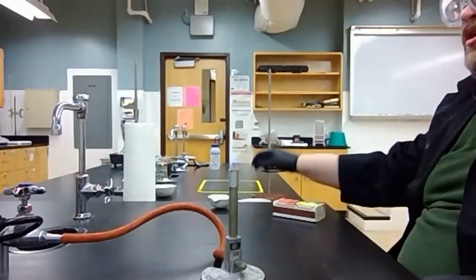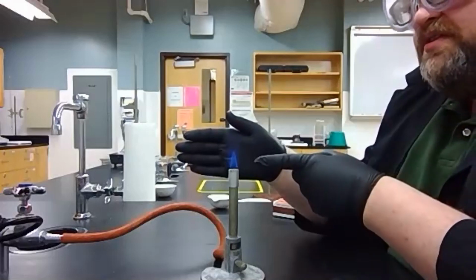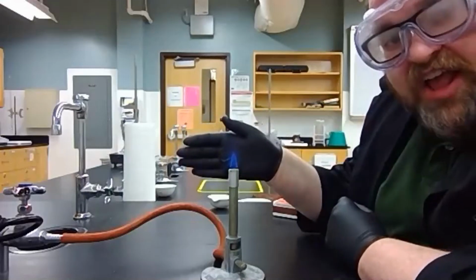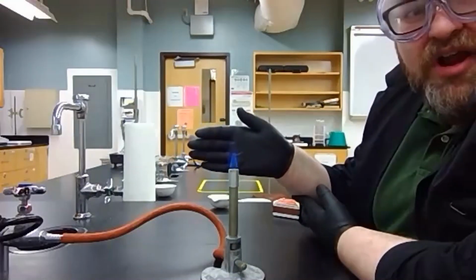Look at that beautiful, stable 2 blue cones of flame. There you go. You can see the inner blue cone and the outer blue cone. The inner blue cone is most definitely the hottest part of this fire. It's the hottest part of any fire. We don't need that much. We're just trying to boil water.